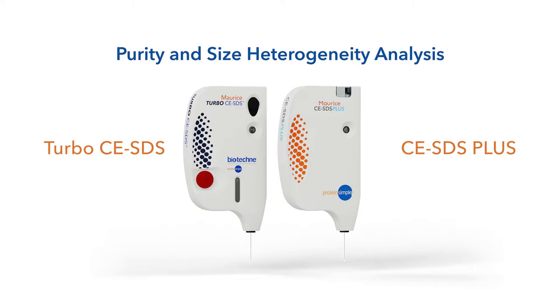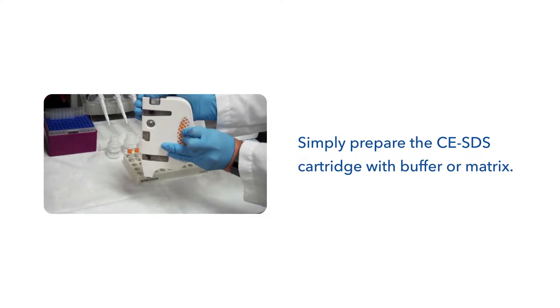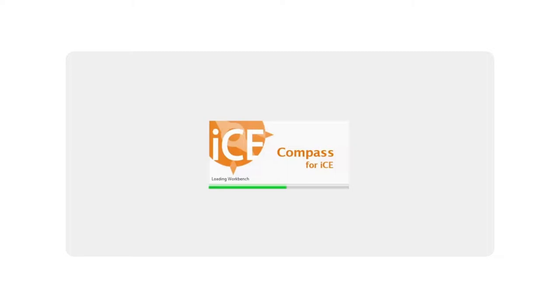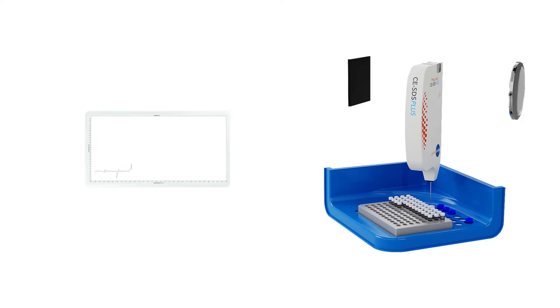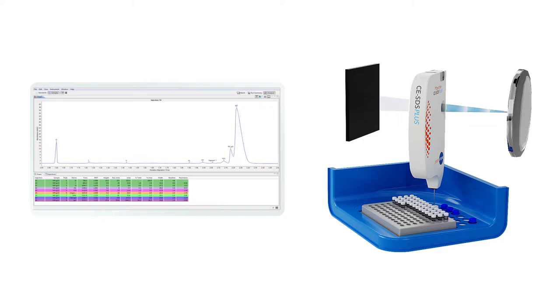Simply prepare the CESDS cartridge with buffer or matrix. Load the reagents and your samples. Close the door, set up a batch, and press start. Maurice will do the rest for you. The sample is injected into the cartridge based on the location you define in the batch. Compass for iCE or Empower software lets you run multiple methods in the same batch, and will automatically analyze the data for you.